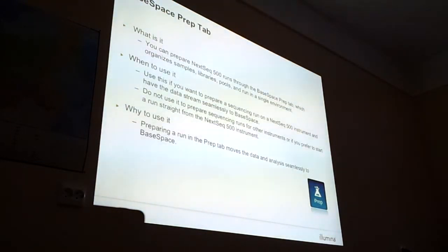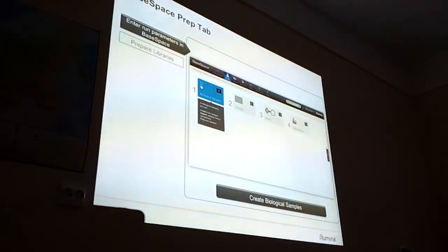Also, you use it for BaseSpace on-site, but you need to define it. Yeah, so it's the same principle with BaseSpace on-site. And it looks like this. Yeah, so this is the screenshot.